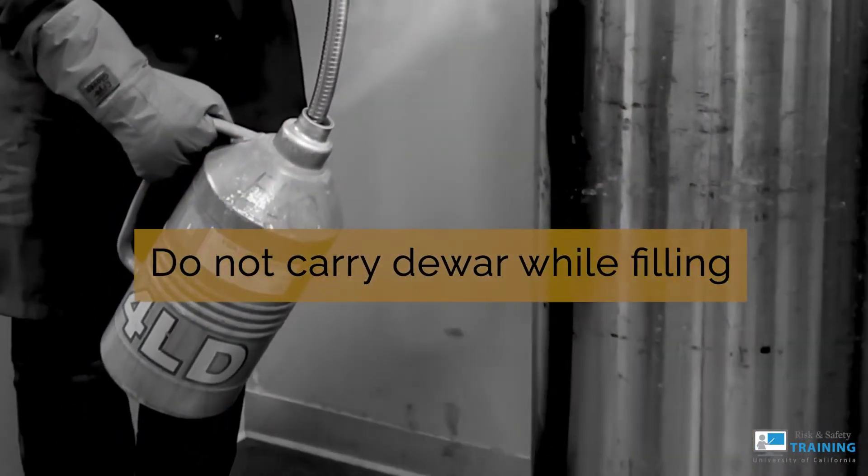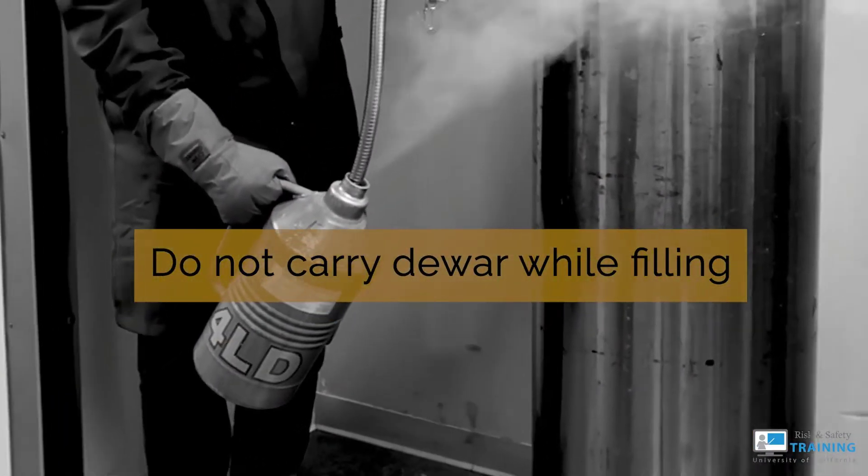If you try to carry the dewar while filling, you risk dropping, spilling, or other injuries.